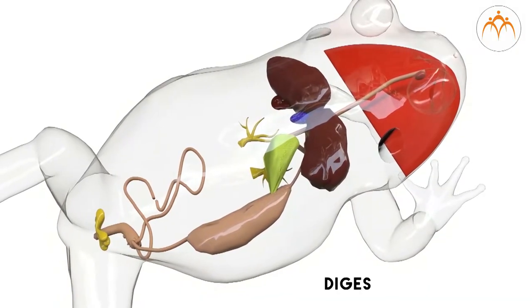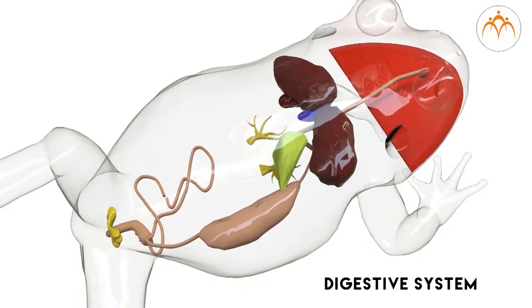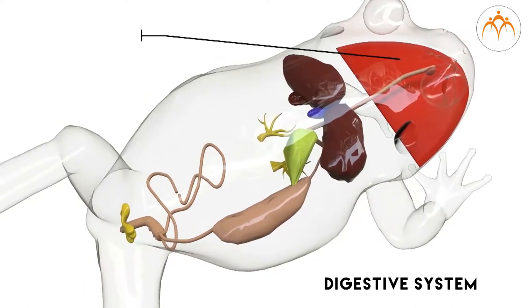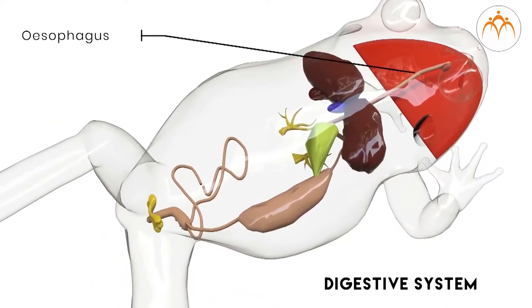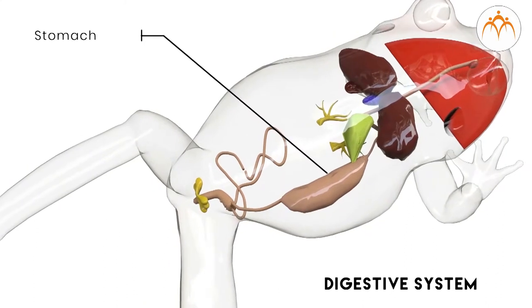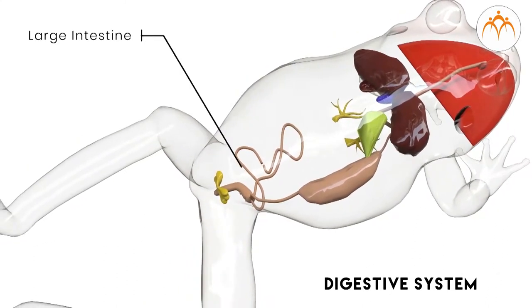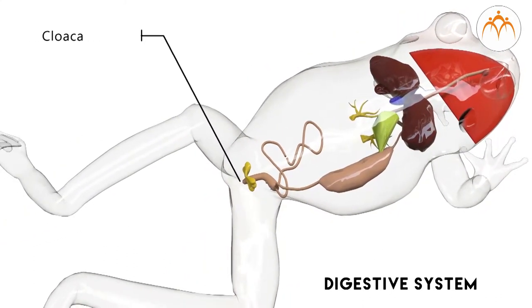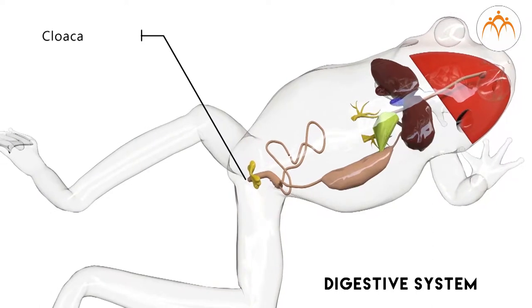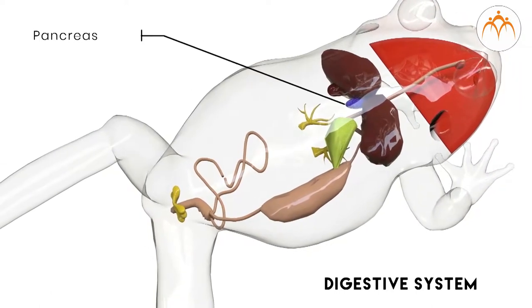We will first see various organs of the digestive system starting from the mouth. The major organs are mouth, pharynx, esophagus, stomach, small intestine, large intestine, and cloaca. There are accessory glands namely liver, pancreas, and gall bladder. The digestive system digests food eaten by the frog and then the digested food is absorbed into the blood. Now, after observing various organs, I will tell you a little more about each one of them.